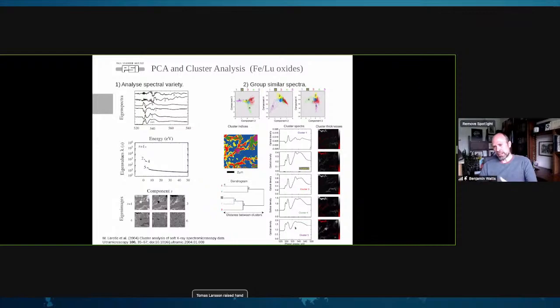So there's a lot of mathematics here, but basically it ends up doing something very similar to the SVD. It's a bit more difficult to say exactly what these clusters are. So the singular value decomposition is definitely preferable if you want to really understand the chemistry of what's happening in your sample.